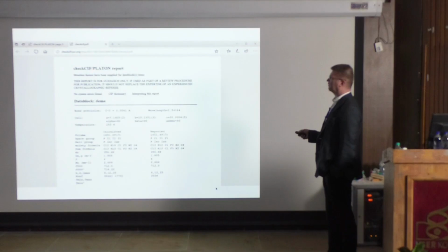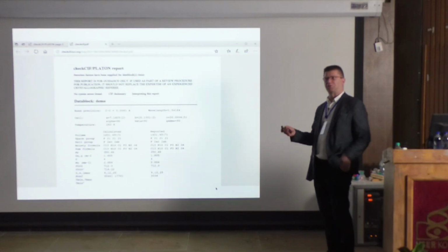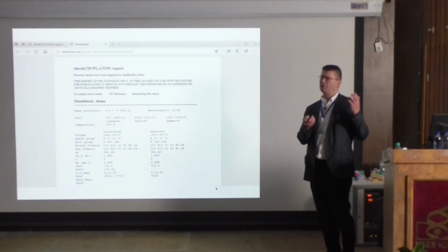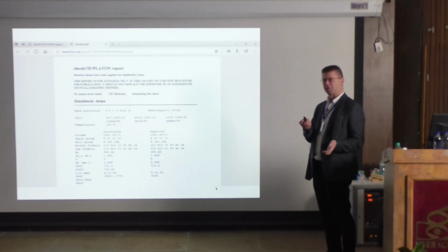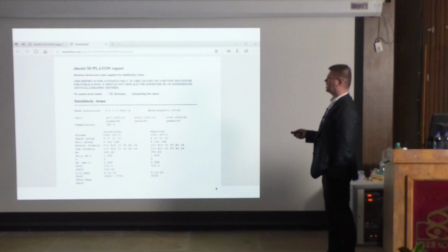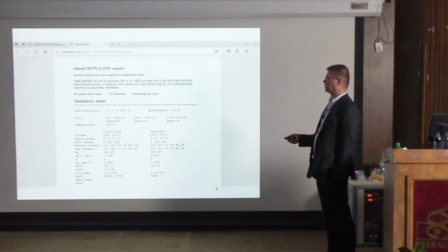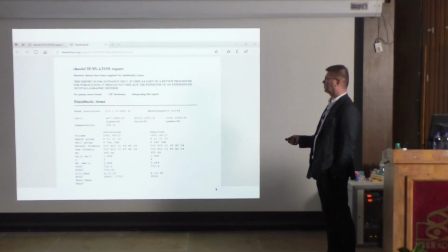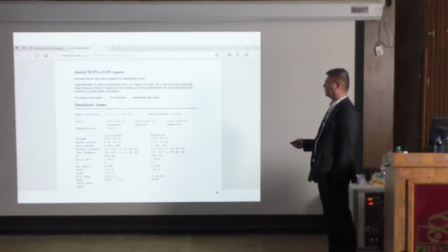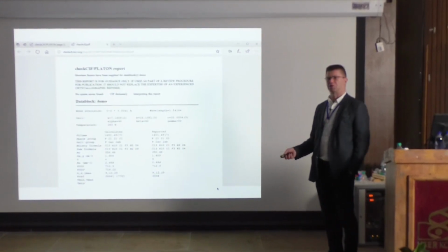We download that from there and it looks like this. So I'd like here a CheckCIF report, this is one other program. And now it says structure factors, meaning the data has been checked too. So it's looking, okay, do you have anything funny in your data? Is something missing? There everything is correctly done. And now that's the same warning as before, and now it starts to print the report. So it says data block is the name, and then it gives you how accurate the carbon-carbon bonds are, the wavelength, the unit cell and the temperature, and now it's making two things.